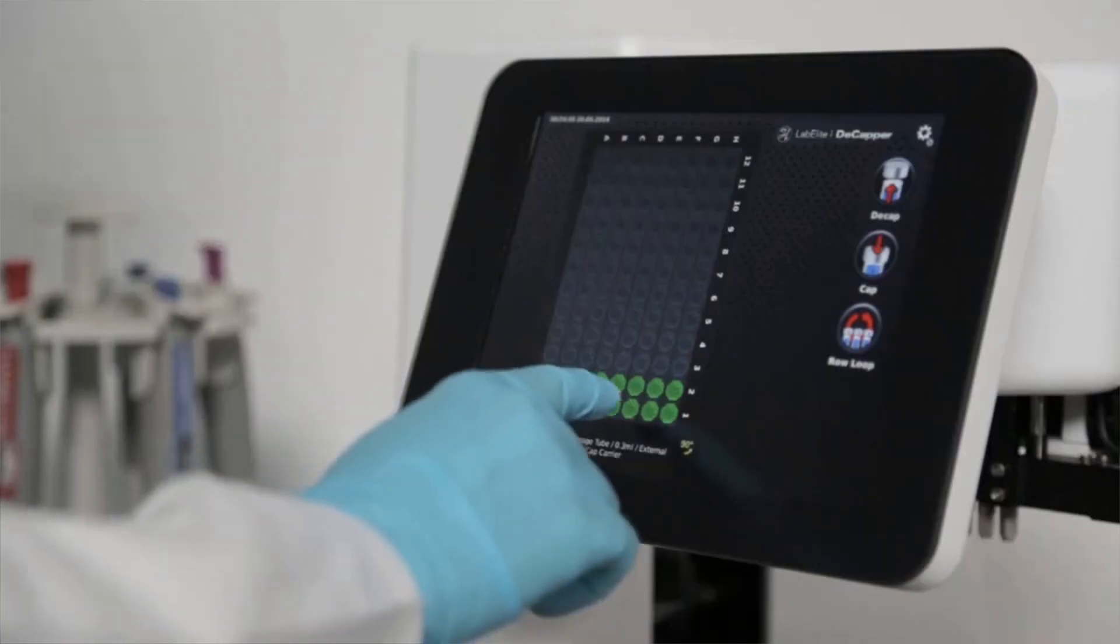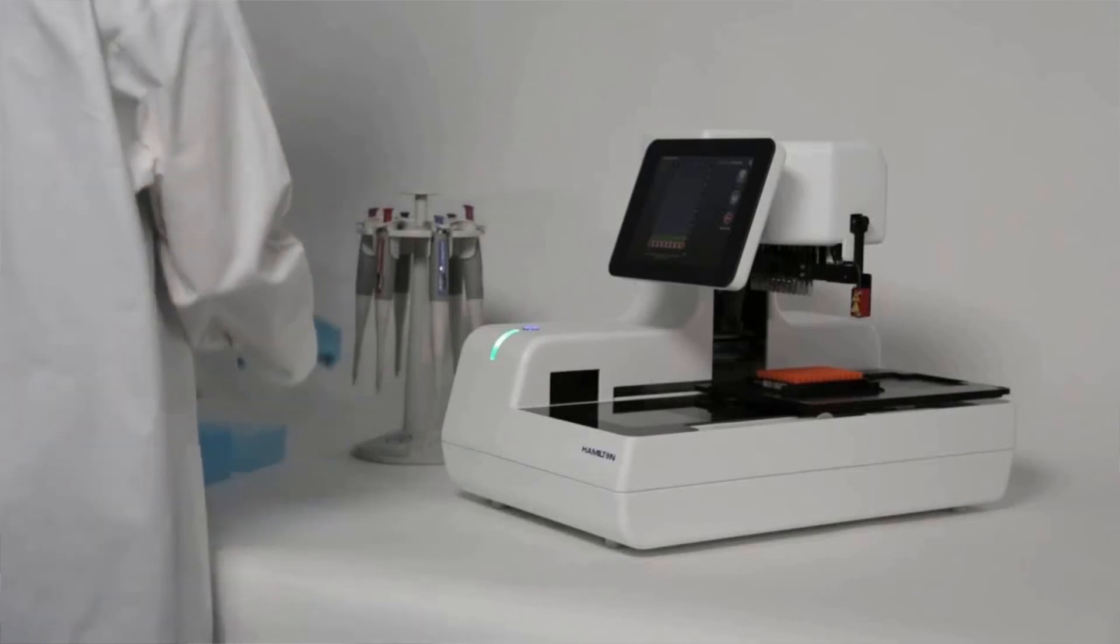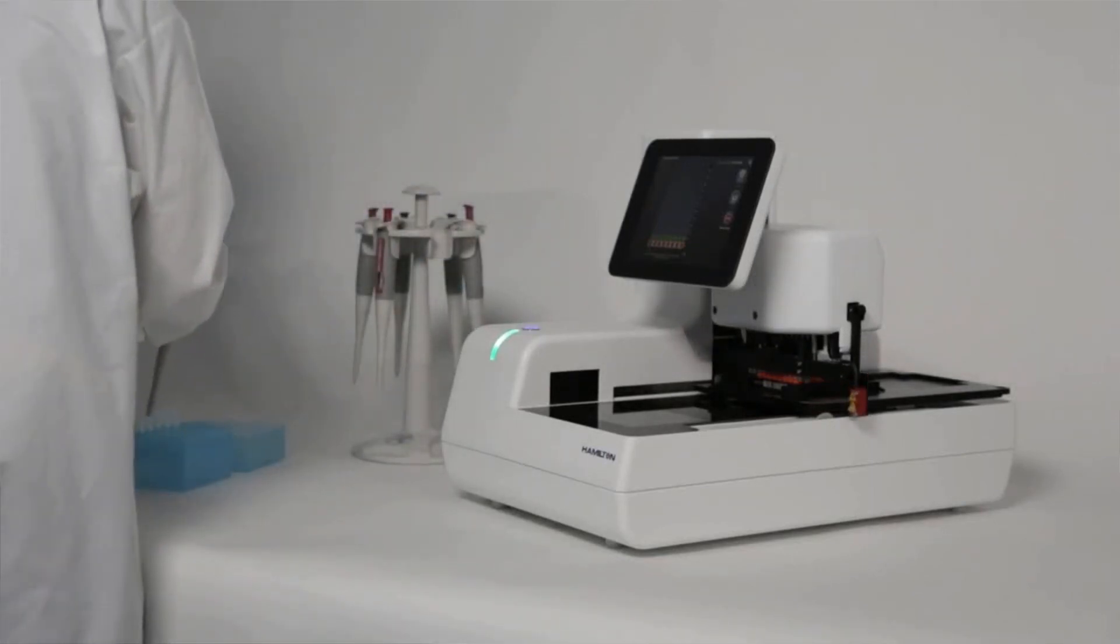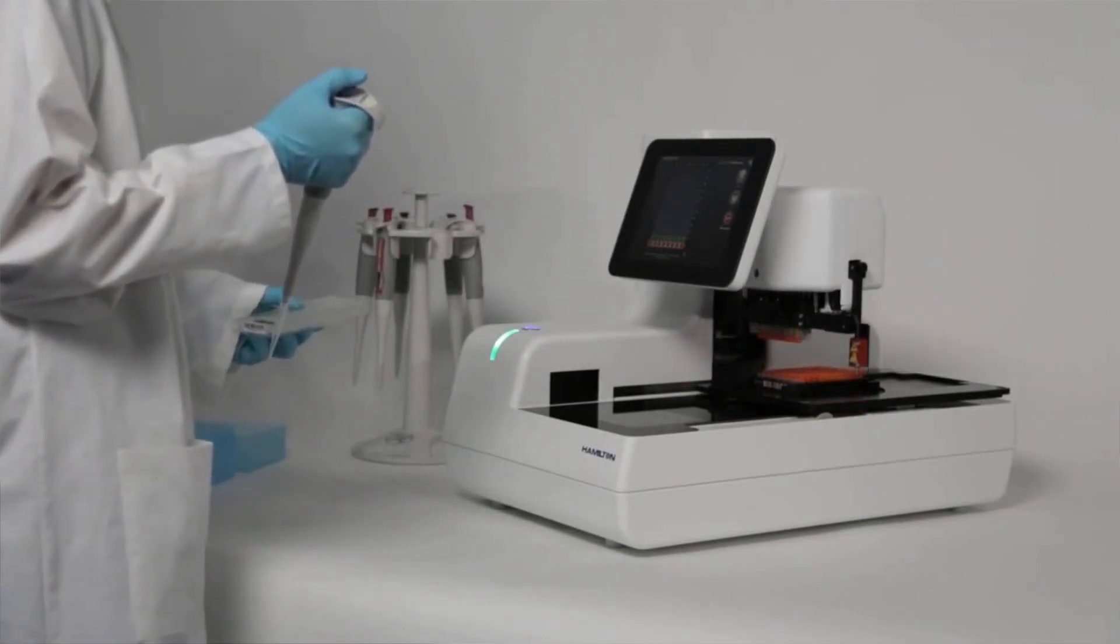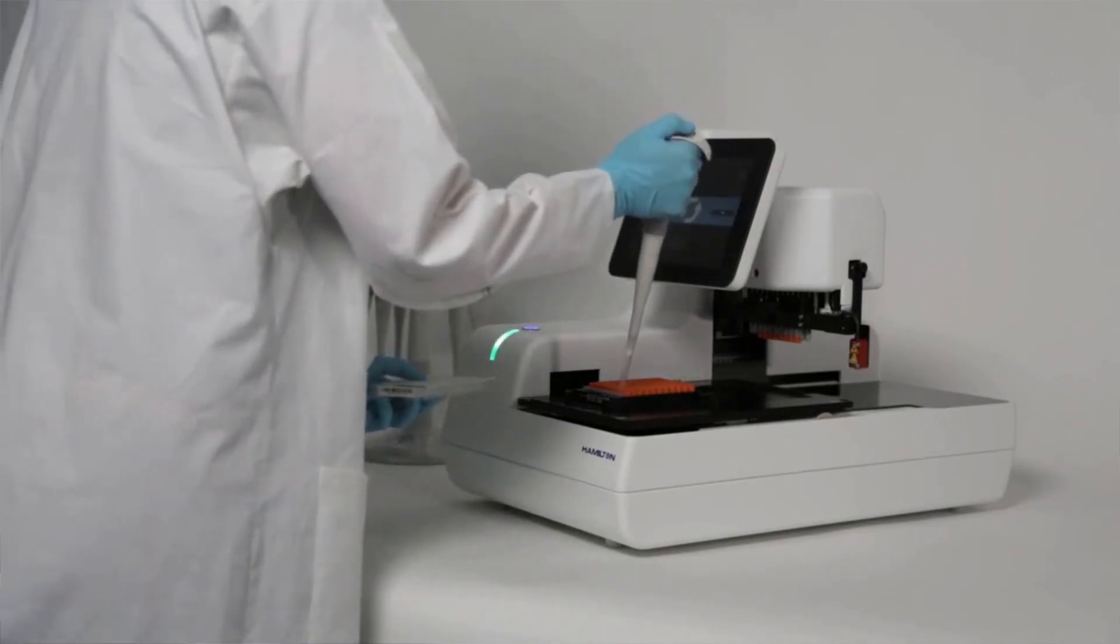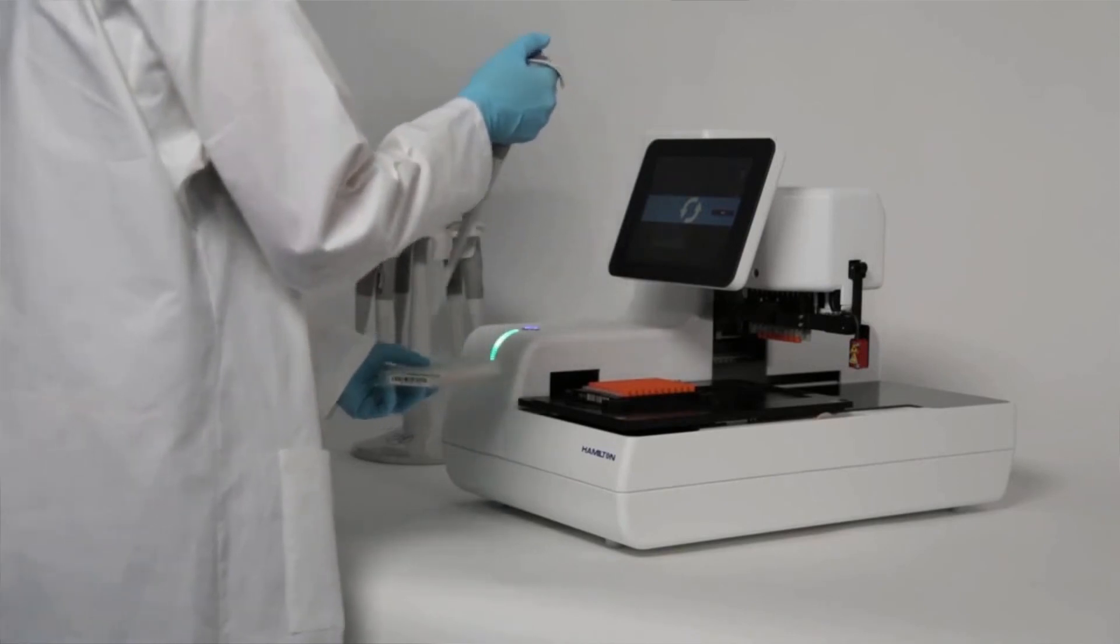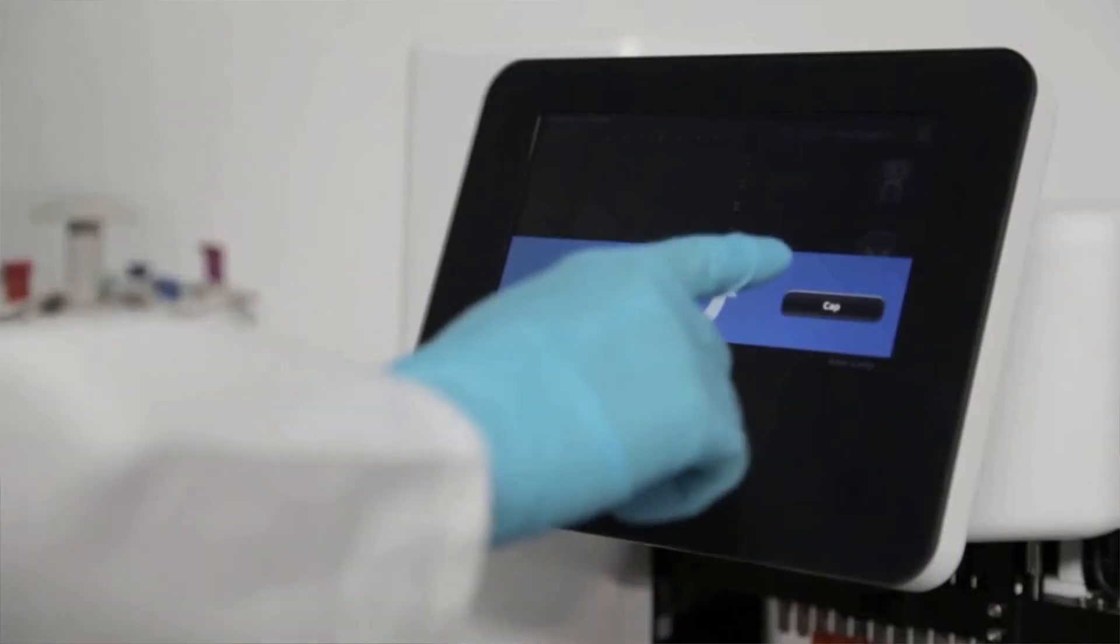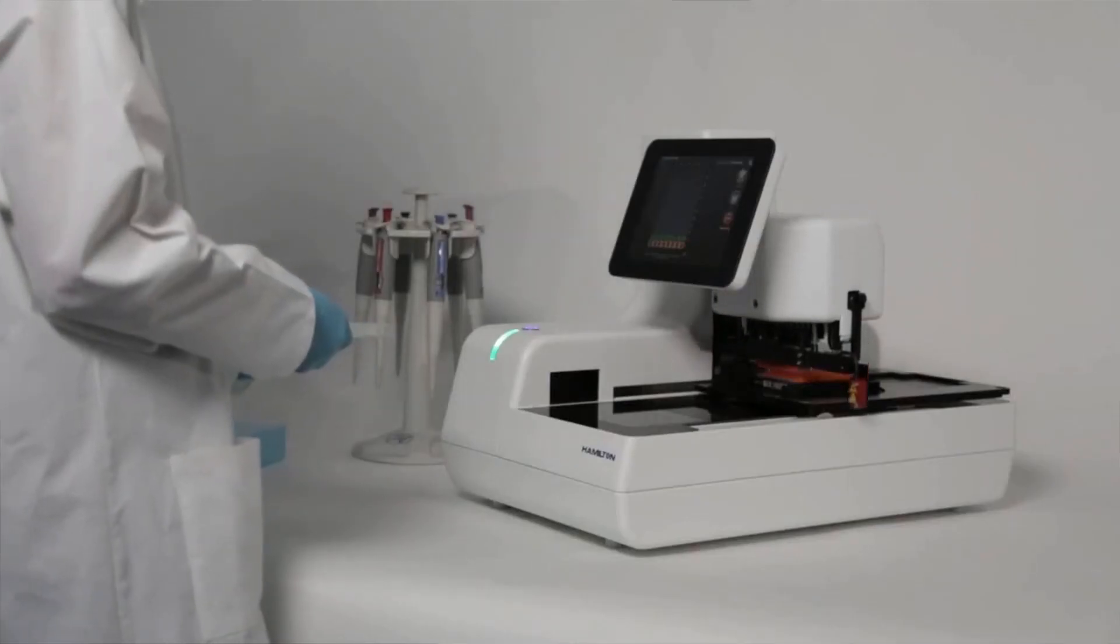Let's take a closer look at the row loop feature. In standard mode, you saw how the system decaps the tubes and holds the caps on the cap rack. With row loop, you can select specific rows and only open, then close, one row at a time, as the caps are held and not placed in the cap rack. Once a chosen row is decapped and perhaps manual pipetting is completed, you simply select cap and next to go on to the next row. This process continues for the remaining rows selected.